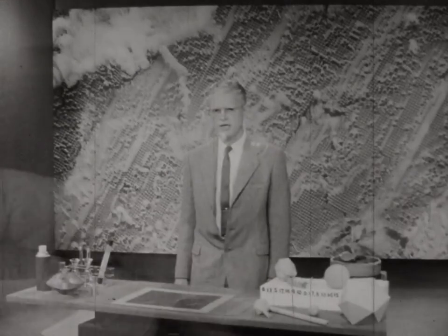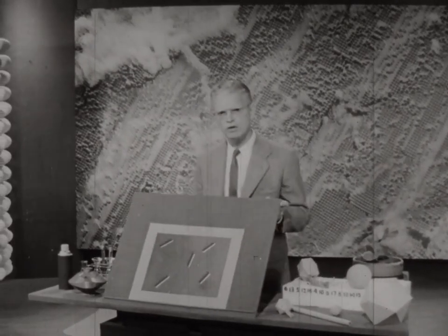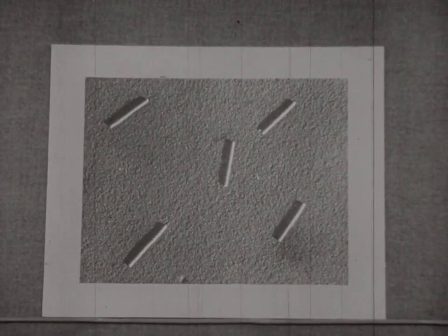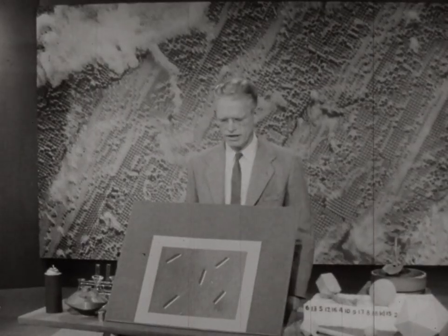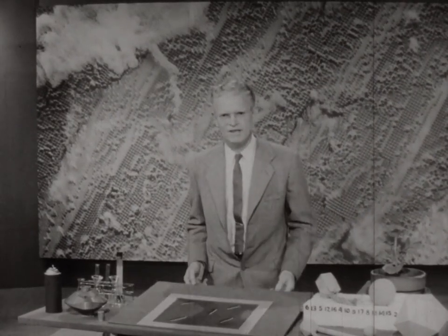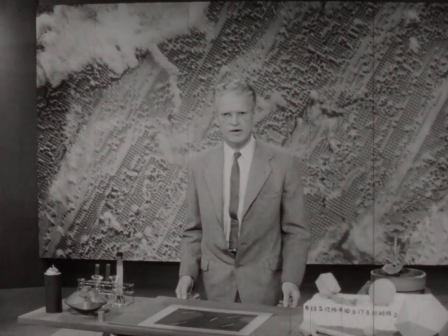By repeating this process one or two times, we're able to arrive at material which is really quite pure. For example, in this electron micrograph of tobacco mosaic virus, we see that we have virus particles and practically nothing else. So it's pretty evident that we can get a solution of purified viruses. Now that we have such a solution, what we'd like to do is to measure the weights and the shapes and sizes of these virus particles.